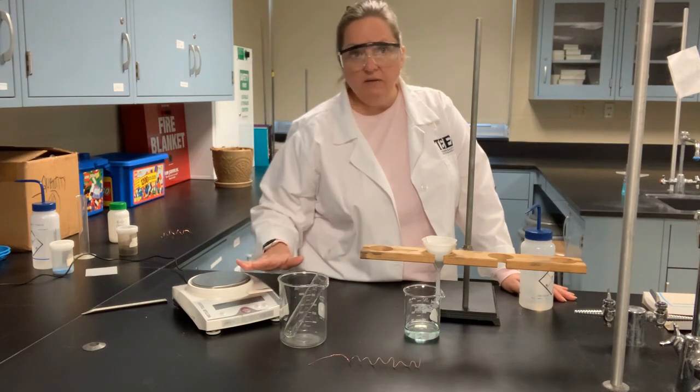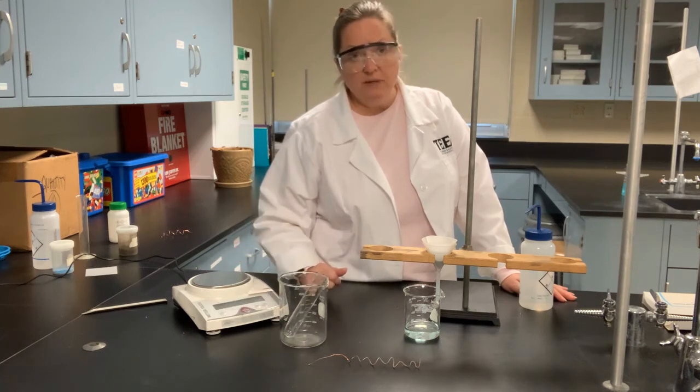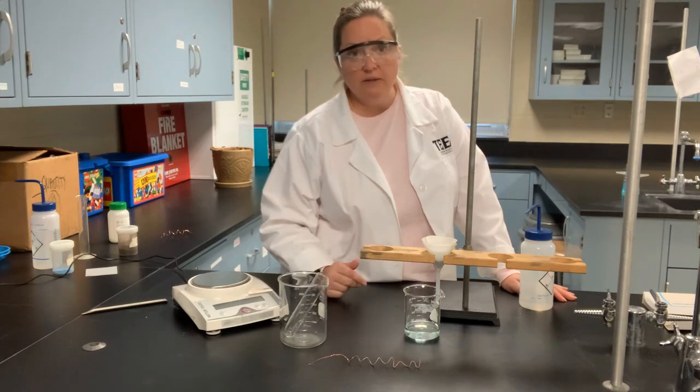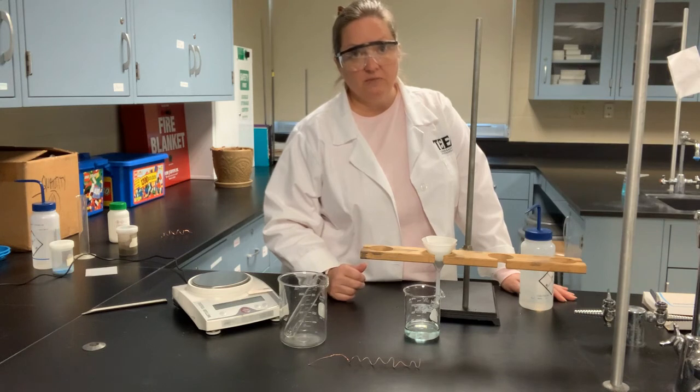And once again, mass it on the balance, knowing the mass of the filter paper and the mass of the filter paper plus the dry silver crystals. I will be able to, via subtraction, determine the mass of the silver crystals actually produced by the experiment, and then compare those to the silver amount that theoretically should have been produced according to my stoichiometry.